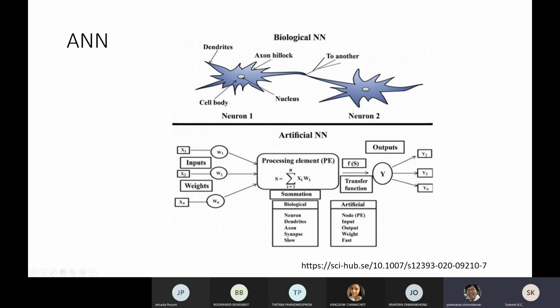Yes, because x1 represents the wavelength of sample number 1. So it gives the weight to x1, and then it produces the output y1. So it depends. If x1 has TSS 13, then it gives an output similar to 13 or 14, like that. It is the predicted output that we get. I see. Thank you, Sneha.